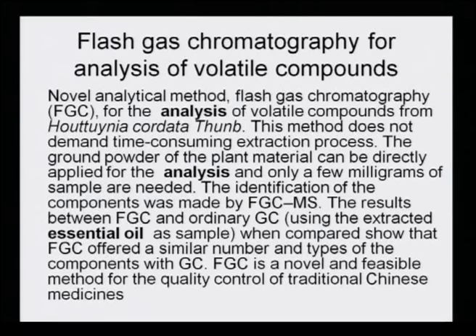Flash gas chromatography for analysis of volatile compounds. Novel analytical method like flash gas chromatography, FGC, for the analysis of volatile compounds from Houttuynia cordata.